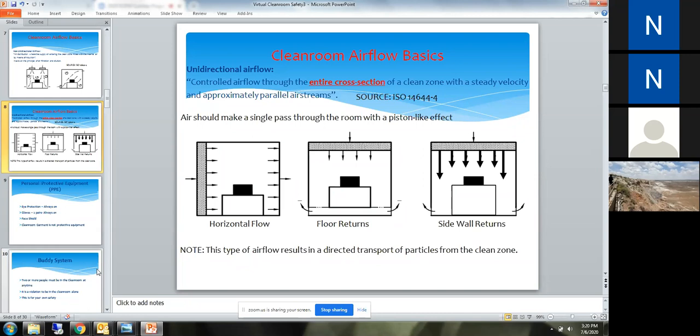Okay, so just two questions here. Do we always have to keep the books inside the clean room? Can you say that one more time? Do we always have to keep the books inside the clean room? Like the notebooks? I'm not so sure, but the regular books. No, you cannot. If they are on regular paper, then the answer would be no.